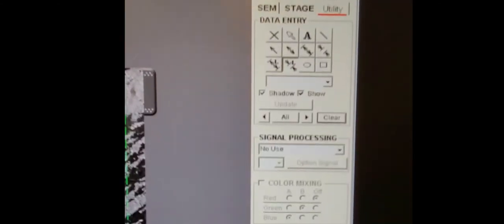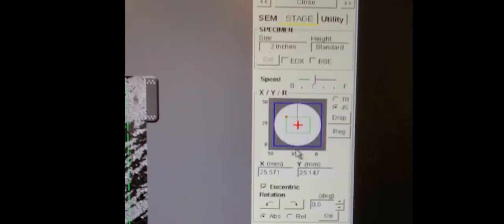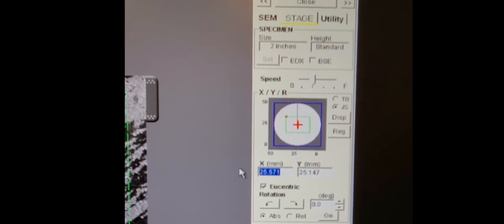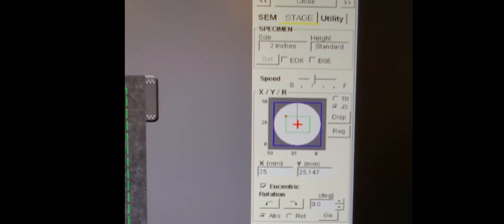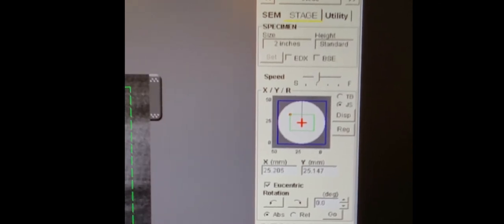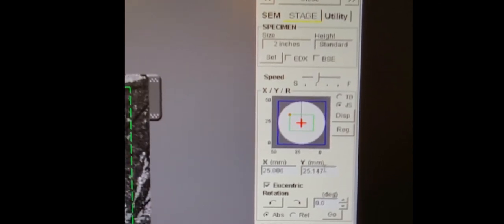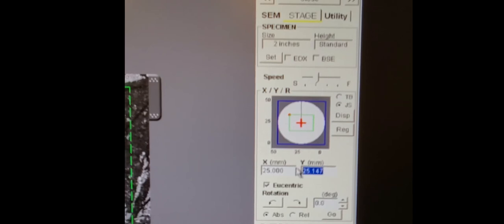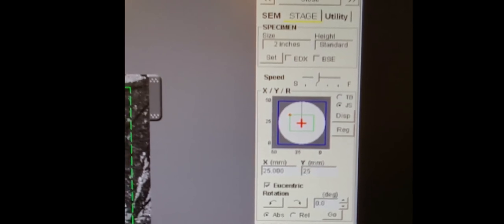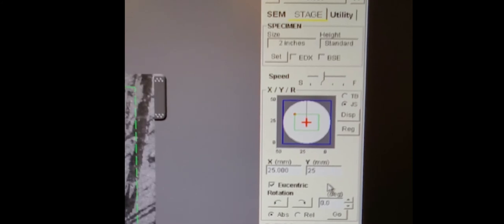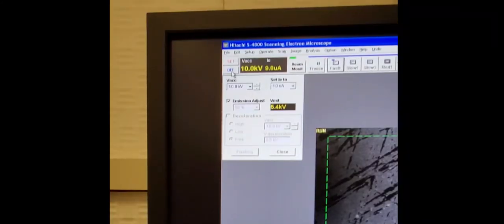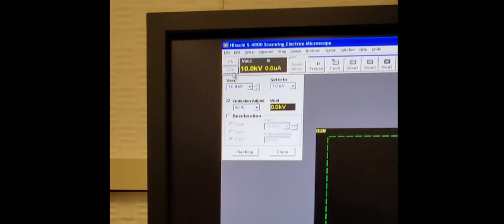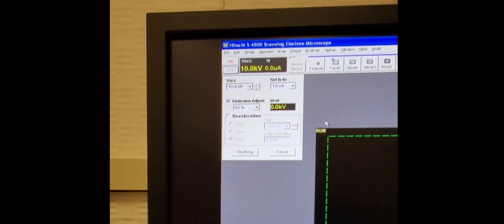So for unloading the sample, we need to make sure the stage is back at its center position. So highlight, physically type 25, press enter and wait for the stage to move. Now it's done, we will move to Y and do the same thing. It is critical that the stage is at the center position X, Y and Z. You can turn off the high voltage in the top left corner.